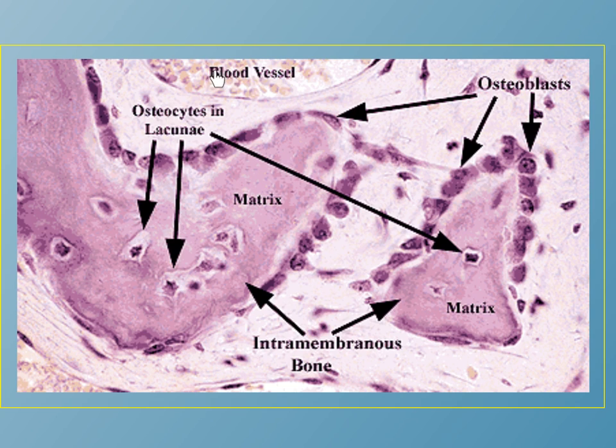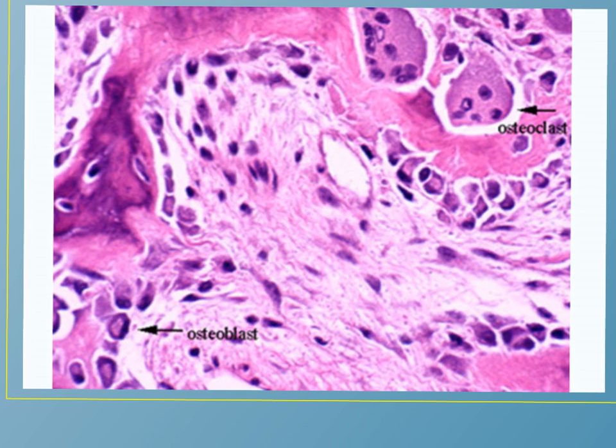This is a blood vessel showing the RBCs and nothing else here. And also here RBCs in a blood vessel. Another picture for the spongy bone.